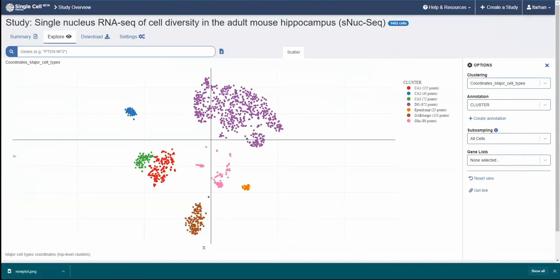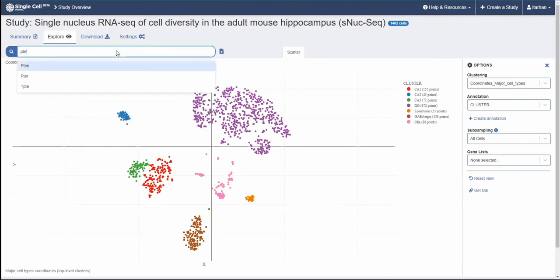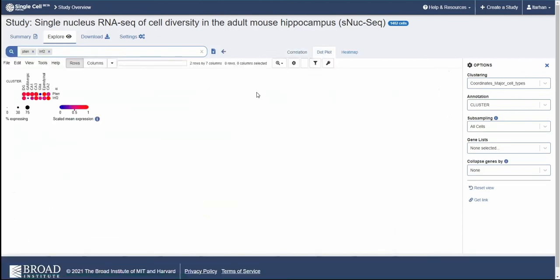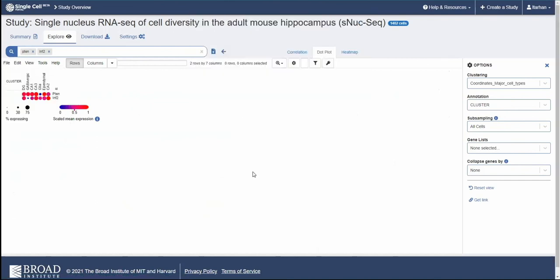Okay, very cool. And can you do the same for the dot plots and things that you were showing too, if you're searching across genes? Yeah, like searching across studies, and you wanted to save one of those dot plot figures. I haven't tried to do that, but I think it has a slightly different control, but you can go to save image. Yeah, it's a slightly different way of doing it. Oh, cool. But that is possible as well.